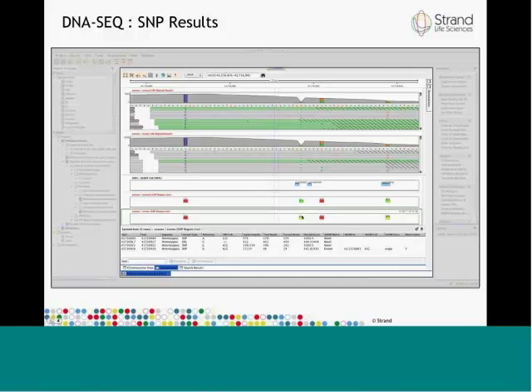This particular SNP, for example, is a deletion, and you can see the nice drop in coverage at that location. This SNP is a homozygous SNP, and you can also see this uni-colored bar here that shows that most of the reads here have a mismatch with the reference, and the color of the bar indicates that the mismatch base is actually C. These 2 SNPs here are heterozygous, as you can see from the multicolored bars here.